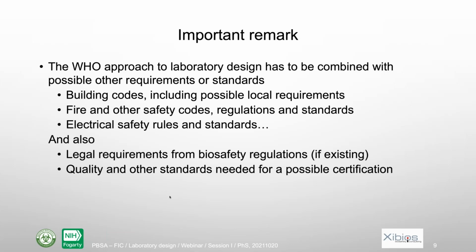You might also want to apply some quality standards, for instance, for certification. In that case, you need also to take that into account. And in countries where there are biosafety regulations, of course, biosafety regulations should also be taken into account.